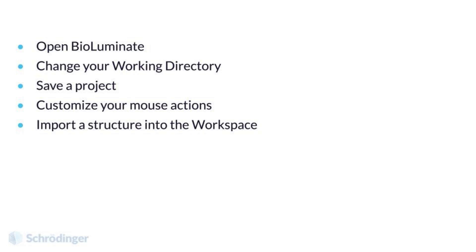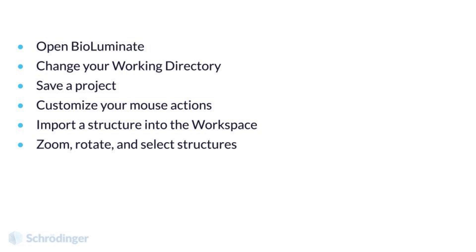You will also be able to import a structure into the workspace, as well as zoom, rotate, and select a structure. Let's get started. Please follow along to help remember the concepts you will cover. Feel free to pause this video or skip back to sections if needed.